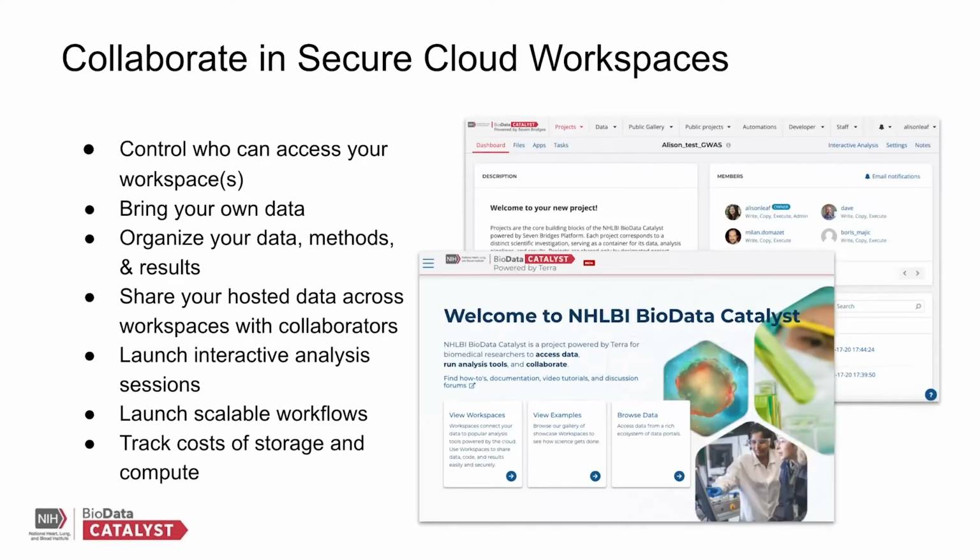Once you have your data access and you're ready to analyze the data, you can do that in a collaborative and secure cloud workspace. There are two options in BioData Catalyst. One is Seven Bridges that you learned about earlier today, and the other is Terra. Both of these workspaces offer features so that you can control who can access your workspace, or you can work in a private workspace. This is the place where you would be able to bring your own data and host it in the ecosystem.